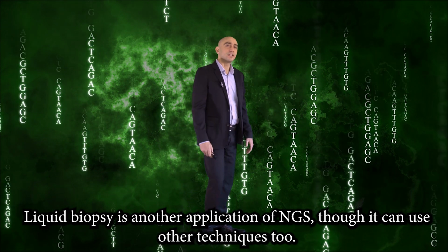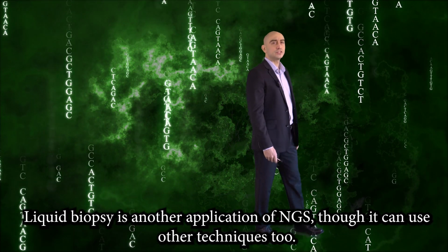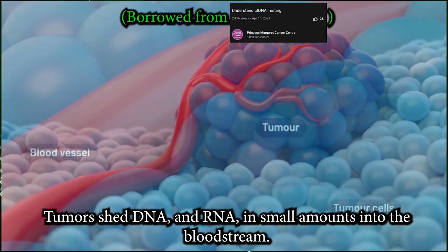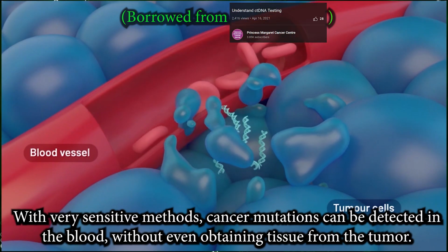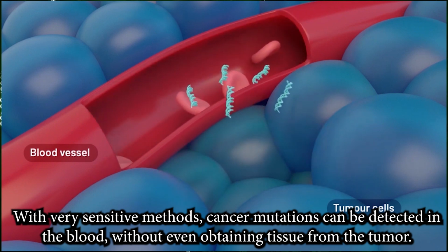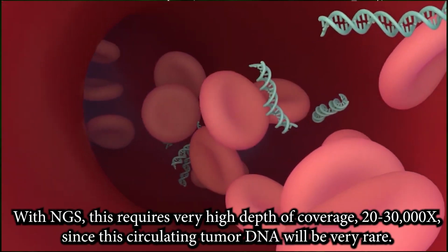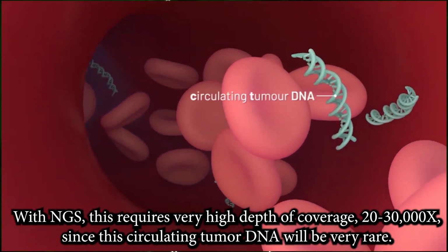Liquid biopsy is another application of NGS, though it can use other techniques too. Tumors shed DNA and RNA in small amounts into the bloodstream. With very sensitive methods, cancer mutations can be detected in the blood without even obtaining tissue from the tumor. With NGS, this requires very high depth of coverage, 20 to 30,000X, since the circulating tumor DNA would be very rare.